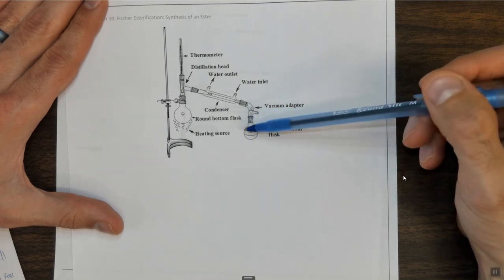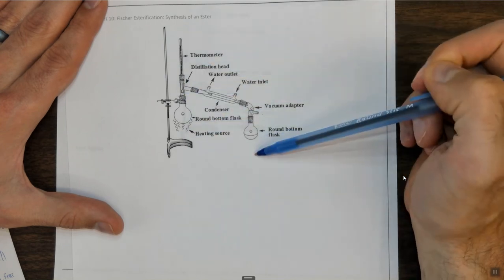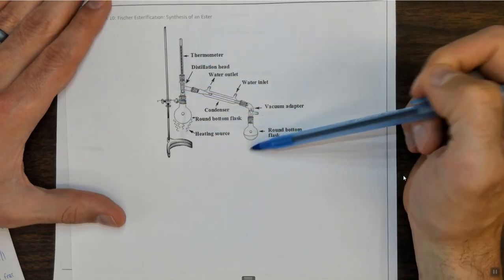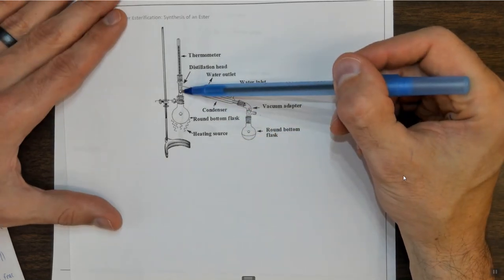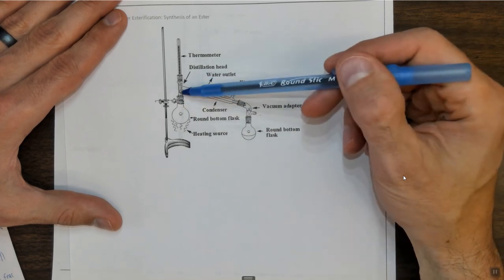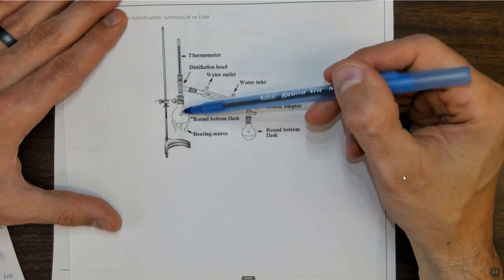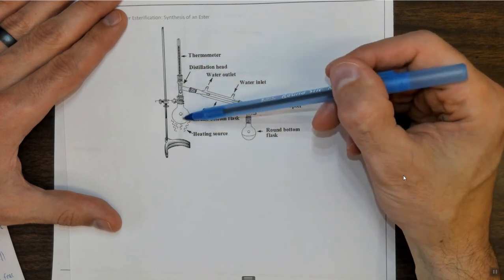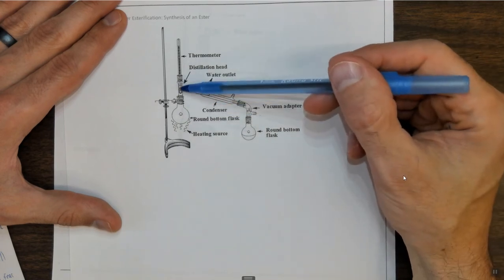Then what should happen, in theory, is this temperature should start to drop as the ether is running out. However, in practice, ether has a boiling point only 10 or 15 degrees above room temperature. So we're not going to necessarily see a large temperature drop, but we should see the temperature start to rise again as the isopropyl acetate, which has a boiling point somewhere around 87 degrees, starts to boil.